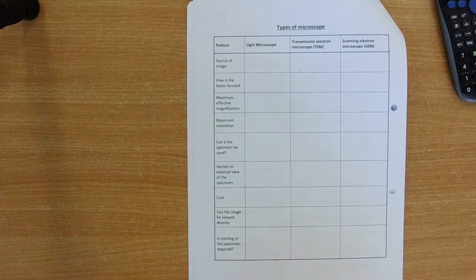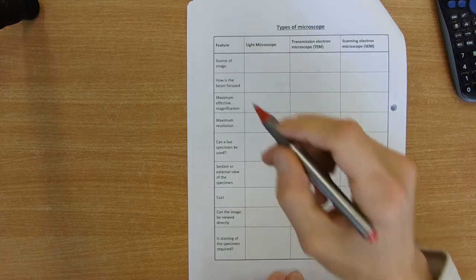So we've got a nice table, types of microscope. In the spec it doesn't really say that you need to know much about the different types of microscope. However, there have been a couple of questions that sort of allude to parts of microscope. So here they are. Source of the image, so light.